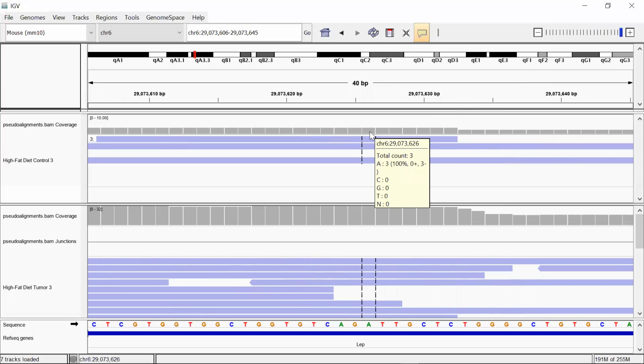What I mean is my IGV application window is just black now. Okay. There is an online version as well, so maybe for next time, I'll give you the information about that version too, using a server instead of your own computer. Gotcha. Okay. Great. So any other questions on IGV right now?